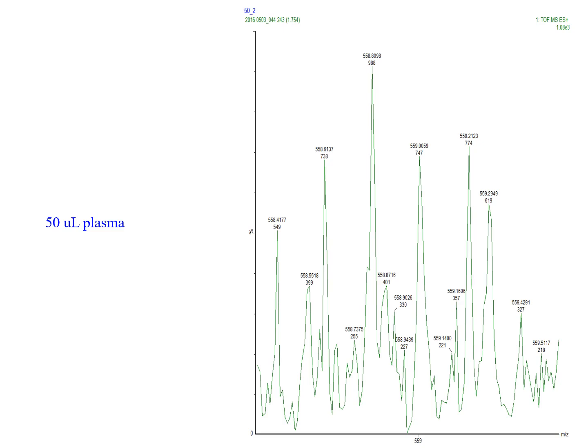And in terms of just taking a 50 microliter sample, doing our sample prep and doing the analysis, we can actually observe Hepcidin 25 at 50 microliters using high-res mass spec, but clearly the background noise is an issue, and we certainly wouldn't claim this to be reliable, but it's actually very promising nonetheless, and certainly indicates to us that going down dilution with another type of serum could well resolve this particular issue.